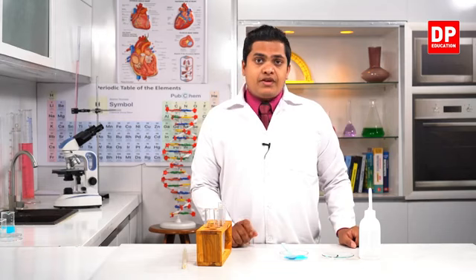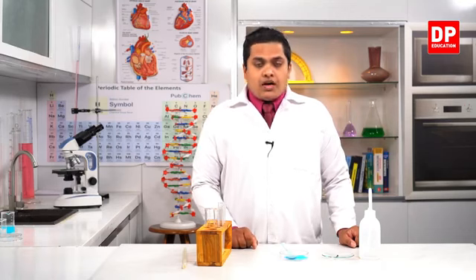And if there is a chemical change, what kind of evidence is provided by the experiment? I'm going to conduct the activity and we'll see what kind of change occurs, and what new substances get created within the system. By using the new substances, we can say that a chemical reaction or a chemical change has occurred.